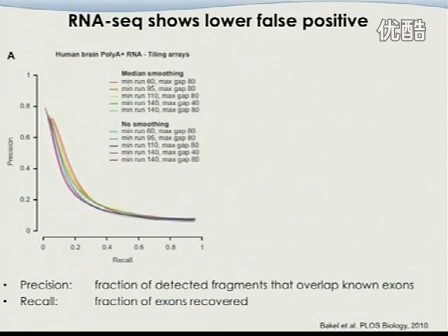So instead of designing probes to target only the genes we're interested in, they target the entire genome. They design probes of 25 base pairs, and every 35 base pairs they put a 25 base pair probe, regardless of whether we know there's a gene there or not. Of course, we only target the parts that are not repetitive regions, which is half of the genome.